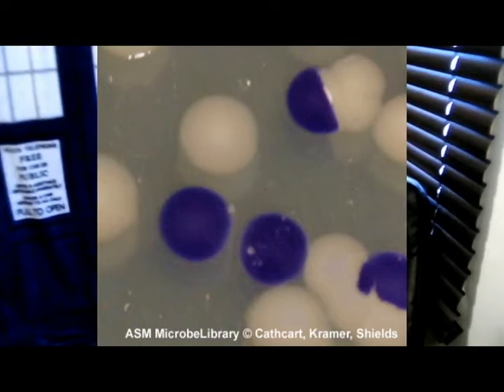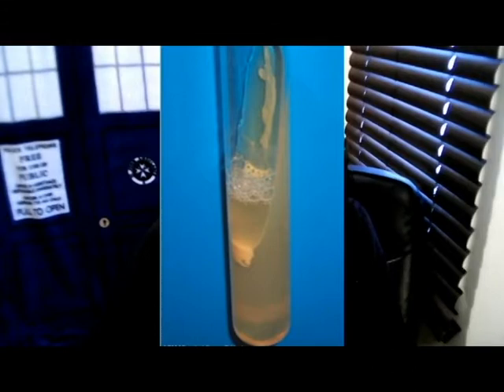So it's important to know that cytochrome C oxidase transports electrons from donor compounds such as NADH to electron acceptors such as oxygen. Catalase test was positive by bubbling, so a possible question could be, how do we determine a positive catalase test? The answers could be change in color, change in liquid form, no change in color, or bubbling, and obviously the answer is bubbling.